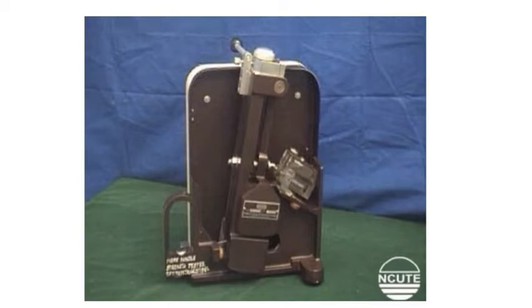In the diagram which we have seen earlier, we saw the pendulum on the left hand side and the beam on the right hand side, because we are drawing the front view of the instrument. This is the back view, hence it is reversed. Then here you have the two jaws where you can place the two jaws. One jaw is held to the beam and the other jaw is held to the pendulum.